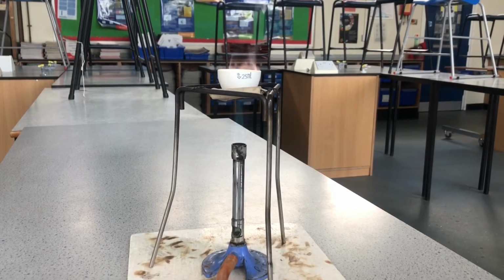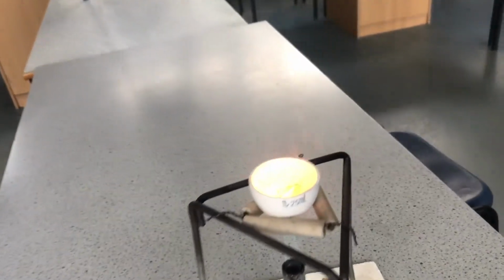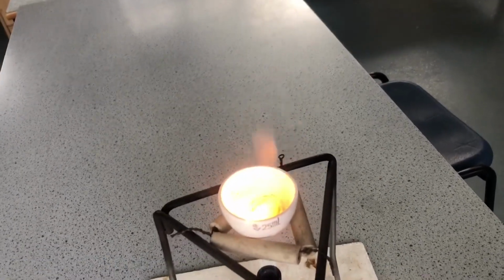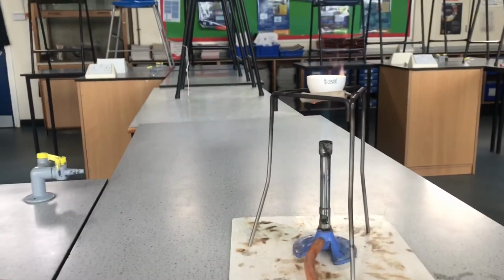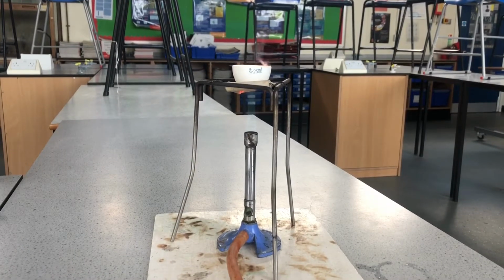So we can just maybe see that glowing slightly. I'm going to lift this up a little bit, and we might just be able to see what's going on there now. So that magnesium is oxidizing. Now that it's reacted, it's turned to magnesium oxide. We'll turn the flame off, let it cool, and then we shall weigh it again and get on with our calculations.